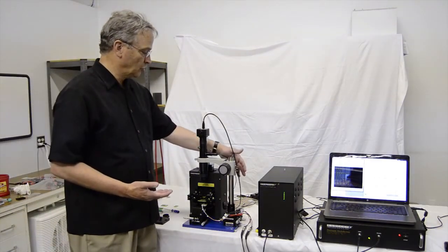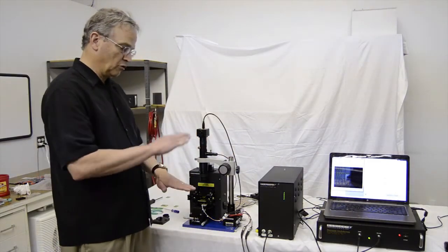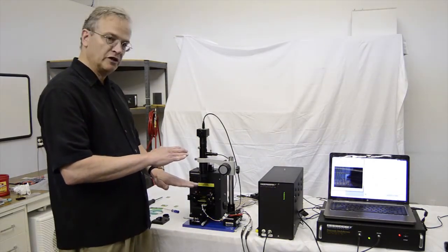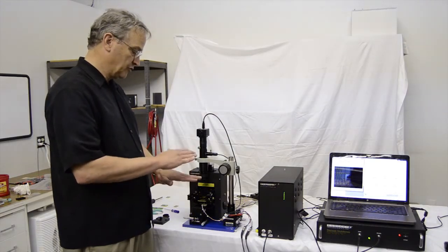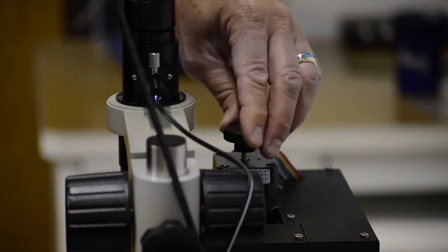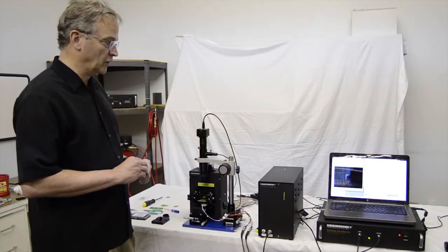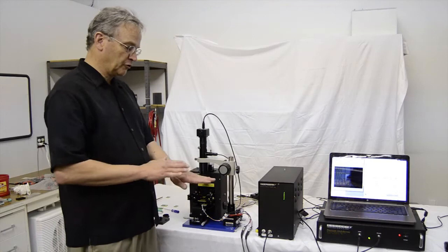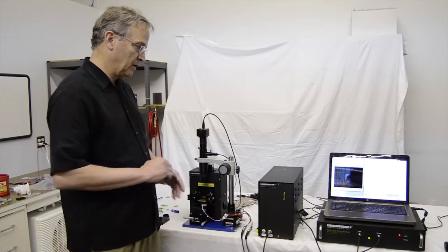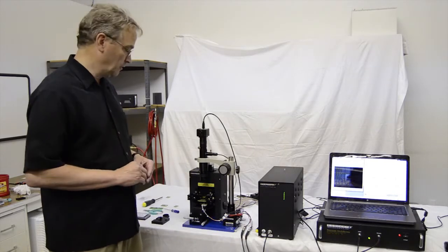The final step is to adjust the focus of the camera on the surface of the sample, because we want the cantilever very high, so when you hit it you don't break it. Align the sample where we want using its translation stages. Focus on the sample and then bring the cantilever down using the knurled knob on the stepper motor until it comes into view and is almost but not quite in focus. By being in focus on the surface with the cantilever slightly out of focus, that means the cantilever will be above the surface of the sample. We now do the final adjustments on the translation stage to put the target area under the cantilever.